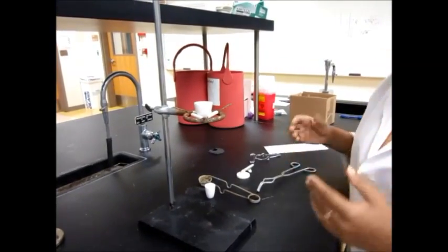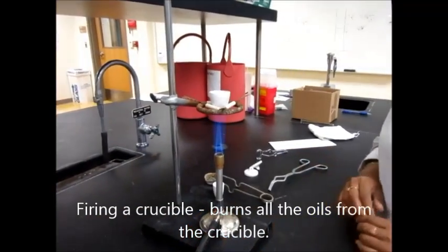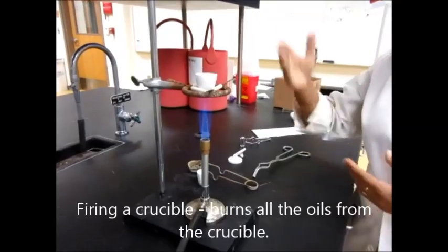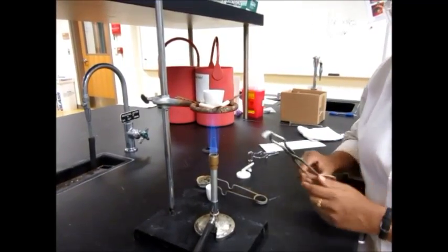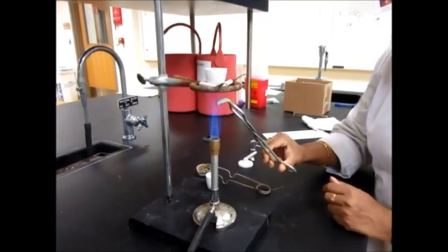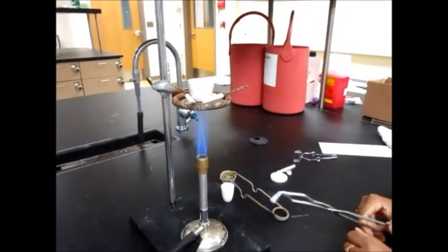If you're just firing a crucible, you are all set now. Go ahead and place the Bunsen burner underneath your crucible and you're all set to go. You can see that the inside cone is right underneath the crucible, which is what you want because you want intense heating usually in a crucible, depending on the experiment.